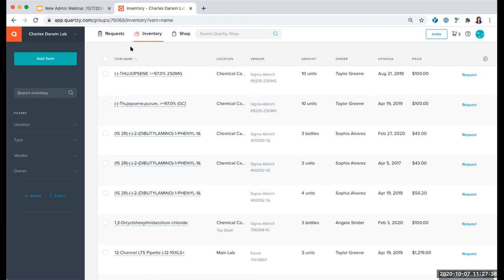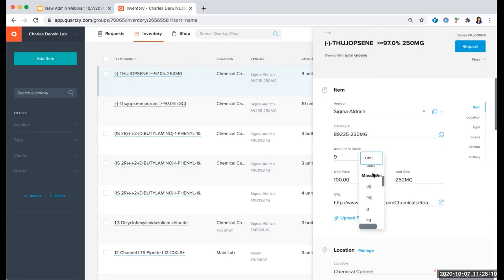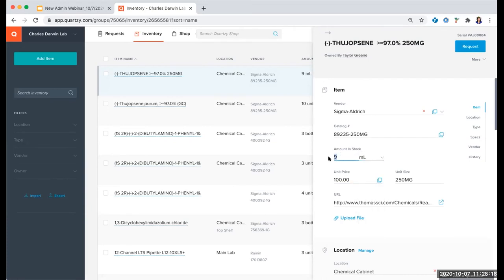A question came in: if materials are automatically updated when used — for example, if they have a 500 ml bottle and use 100 ml, will it update the quantity? That is going to be just the same as updating any quantity — it will have to be done manually by somebody in the lab going to the Amount in Stock field. What I didn't point out yet is that you do have the option to get really detailed into those units. So if you are keeping track of how many mls you have of something, you can change the numbers to customize whether it's the quantity of items or quantity based on volume or weight. But it still needs to be updated manually.